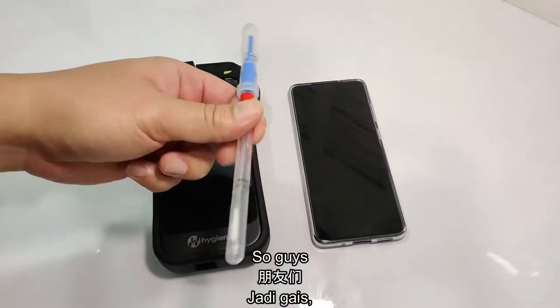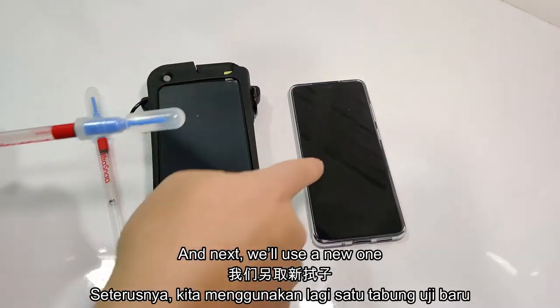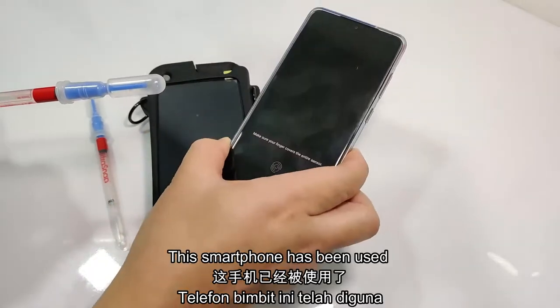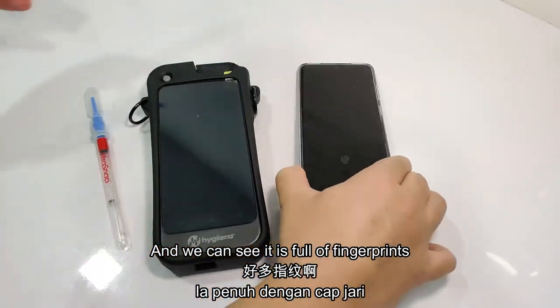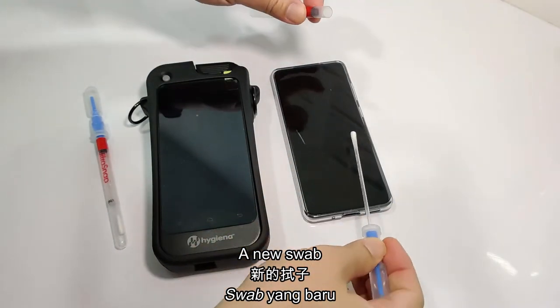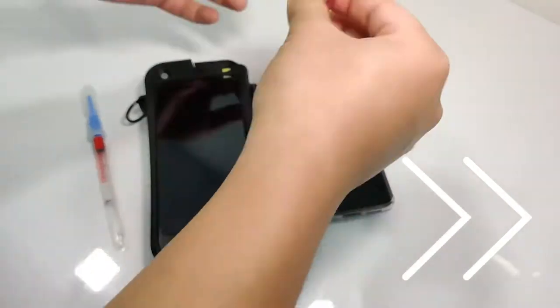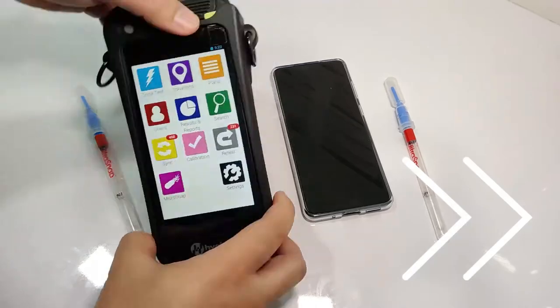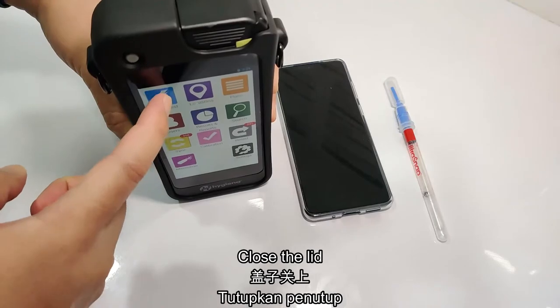So guys, this swab was used in the toilet — we'll leave it here. Next, we'll use a new one to swab the smartphone surface. Let's see. This smartphone has been used for a full day and we can see it's full of fingerprints. Okay, let's place it down, take a new swab, and let's swab.